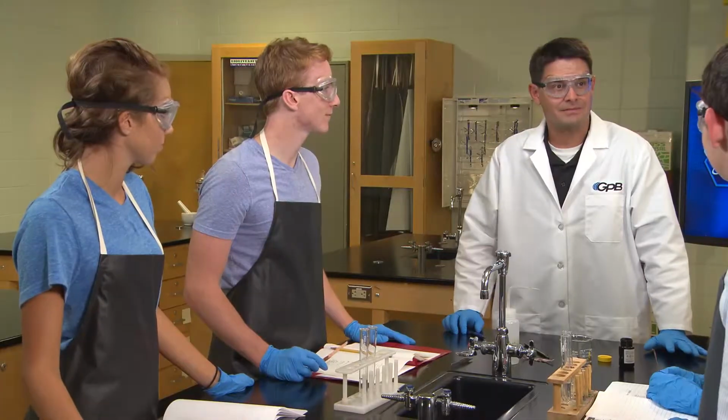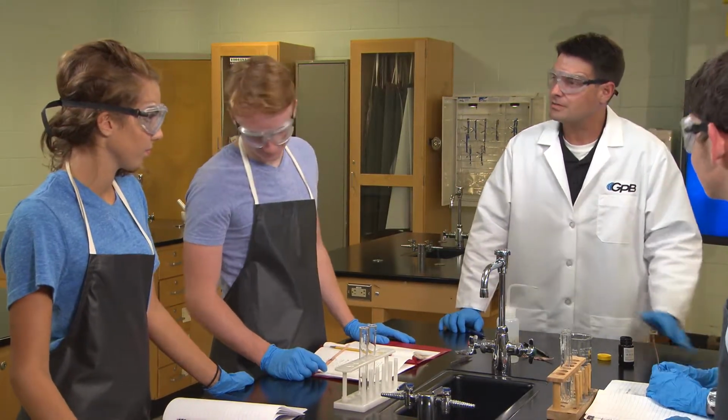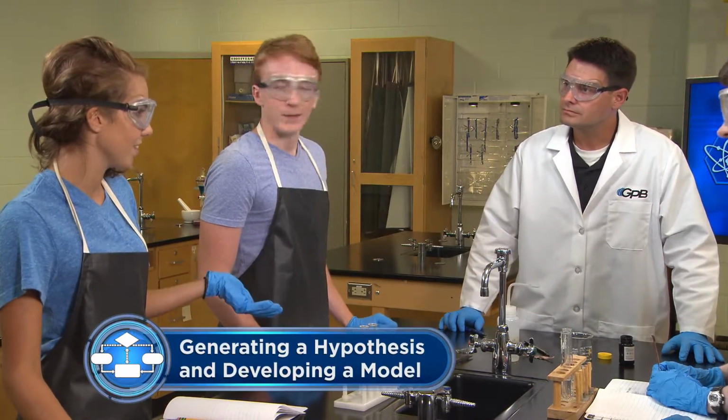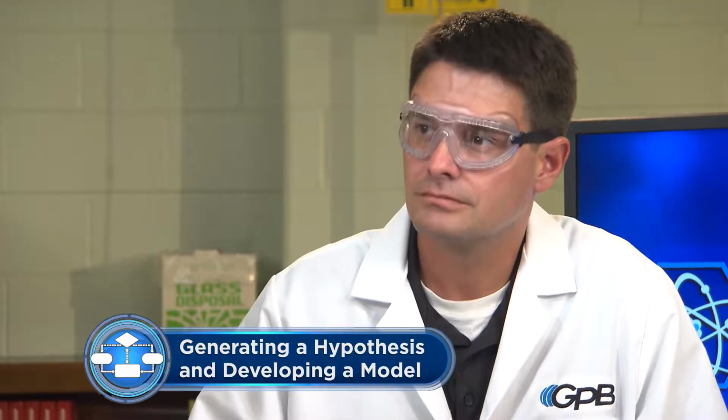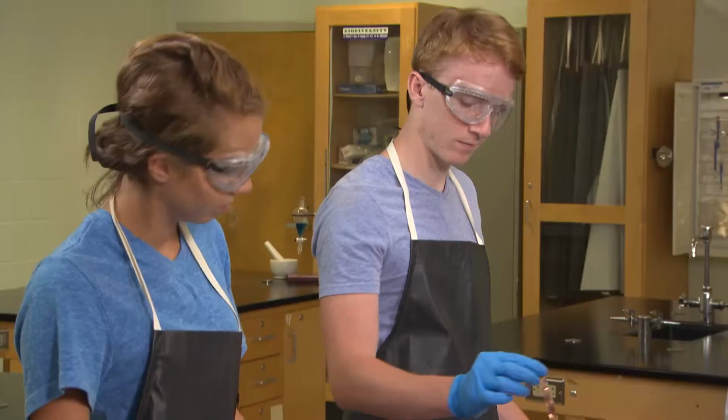To see exactly what I mean, let's get back to our classroom. So each team has a piece of copper and a test tube of distilled water. Now, if I asked you to place the copper into the test tube, what do you think would happen? Nothing, right? We've talked about this in our discussion about elements back in Unit 3. It's like throwing pennies in a fountain. Okay, well, let's test your hypothesis. Place the copper into the test tube.